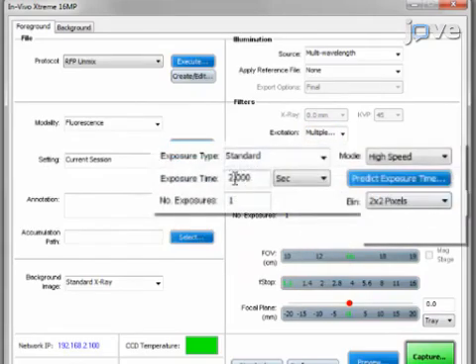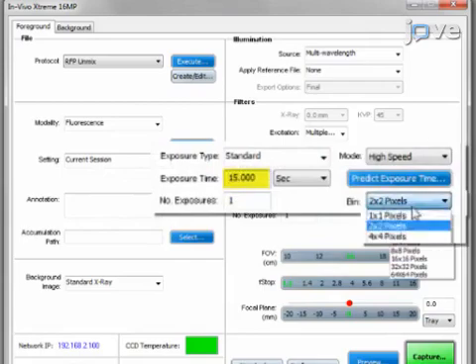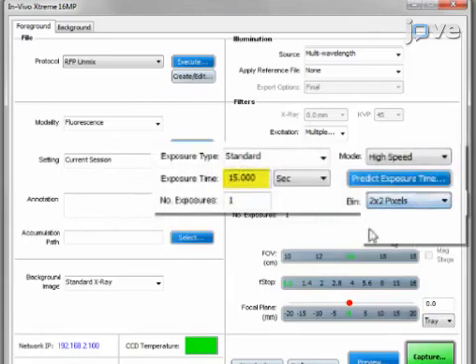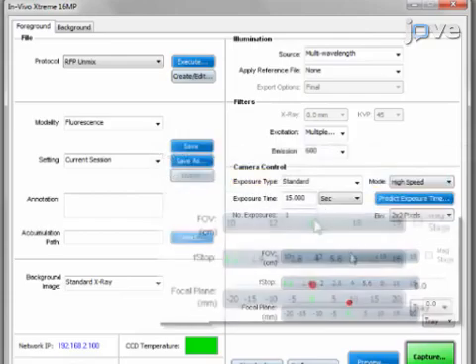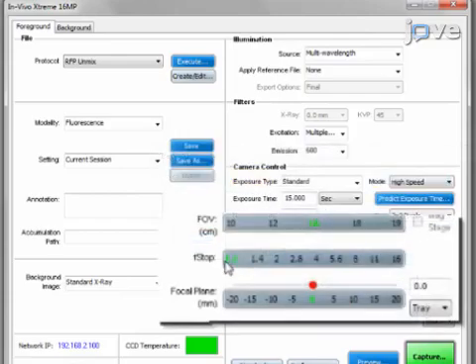Select a standard exposure of 15 seconds, 2x2 binning, a field of view of 16 centimeters, and an f-stop of 1.1.